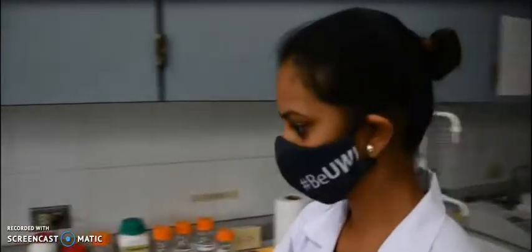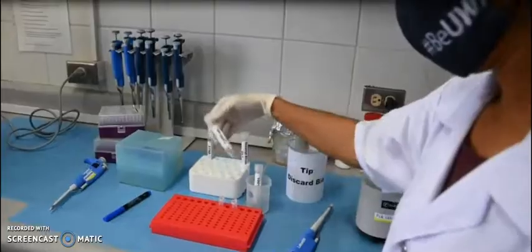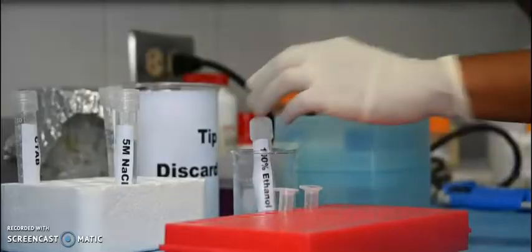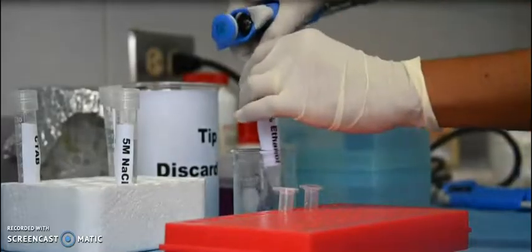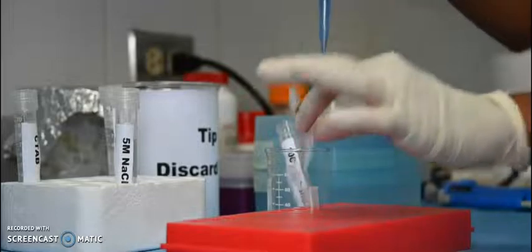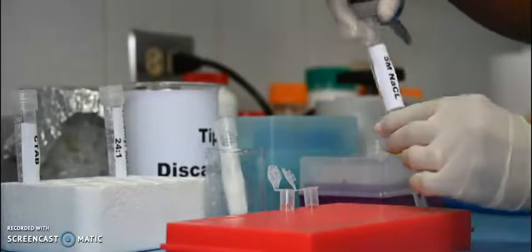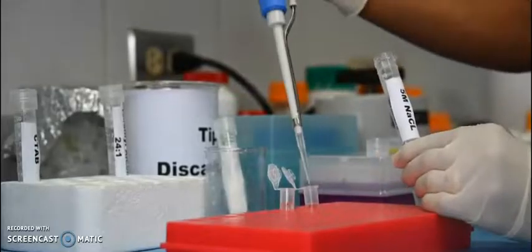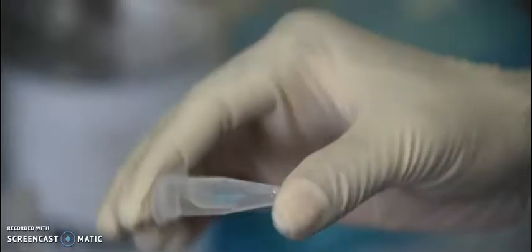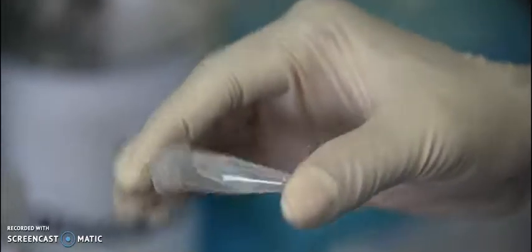To this, add 600 microliters of ice cold ethanol and 150 microliters of sodium chloride solution. Now mix the solution and centrifuge at 13,000 RPM for 10 minutes.